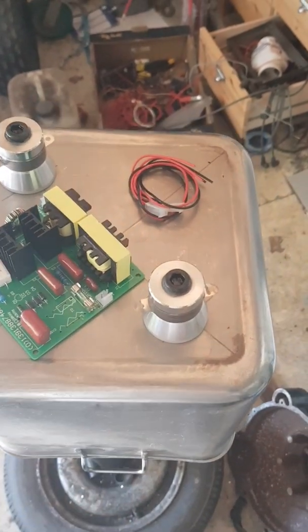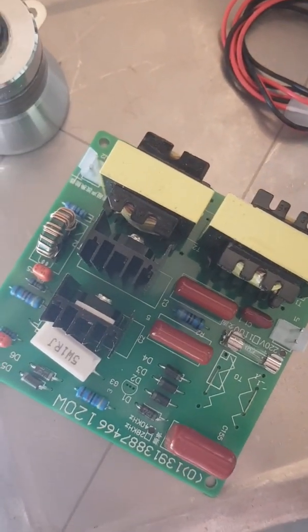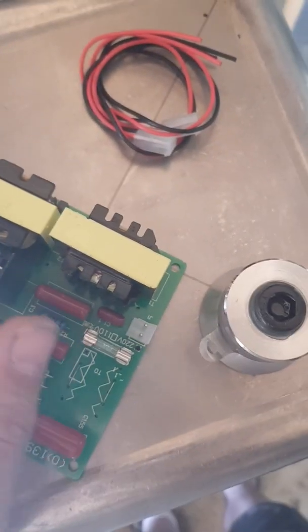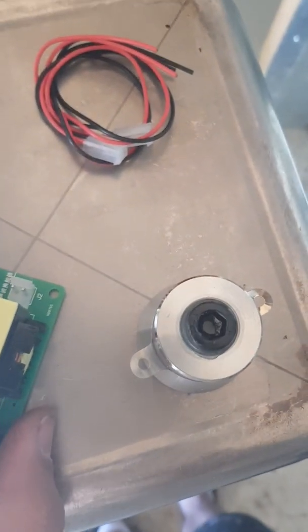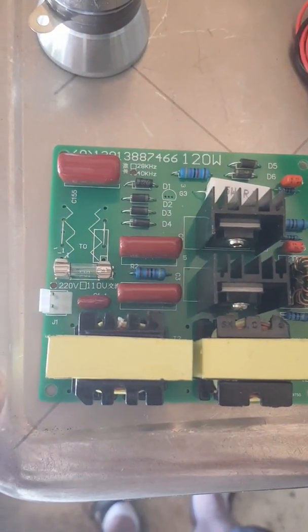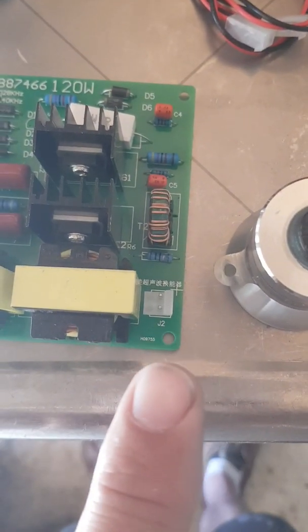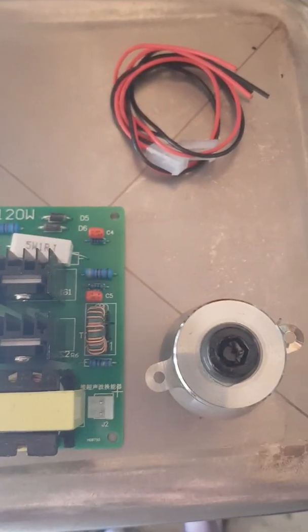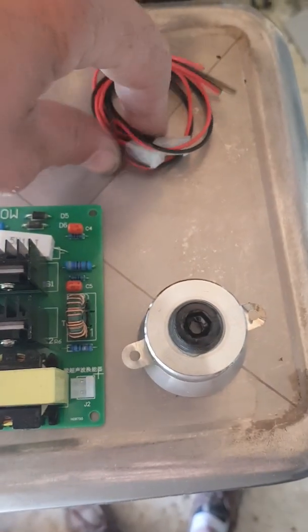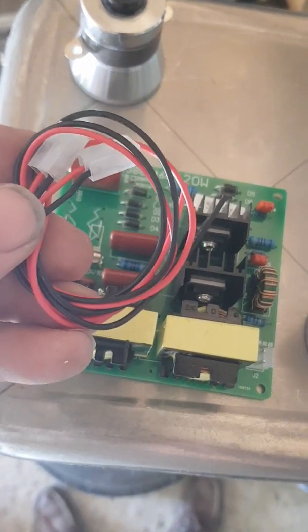Funny thing is I bought this with two transducers, but if you look at the circuit board there's only one outlet for the transducers, which means I have to split the wires. This is not really super quality, but it doesn't matter because it was dirt cheap. It's 220 volt — because that's what we have in Norway — and the outlet for the transducers is right there.